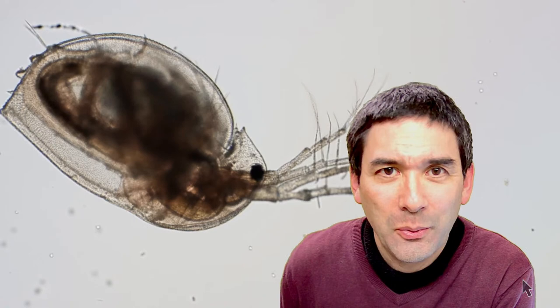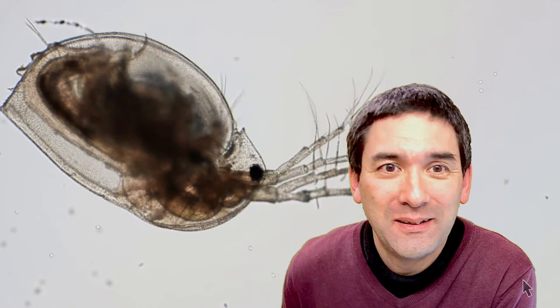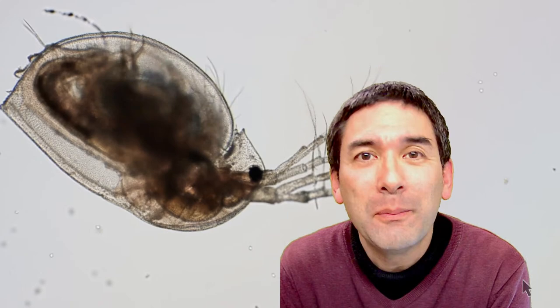Hello and welcome — Microbe Hunter here, and welcome again to another Saturday microscopy live stream. Today I wanted to show you some Daphnia, which are water fleas — you can see one right now in the background — and I also prepared some Artemia brine shrimp, also known as sea monkeys, that I'd like to show you as well. Please give me a short feedback if you're able to hear me and if everything is working.